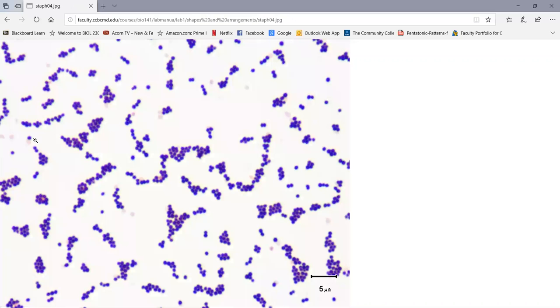Whereas this is a staphylococcus. So again, now you see lots of little clusters. They're tapering clusters. They're no more than, at the most, four or five across. Most are smaller than that. Some of them break apart. As you smear them on the slide, we see short chains, pairs, singles, but the predominant arrangement we're seeing there is a staphylococcal arrangement.